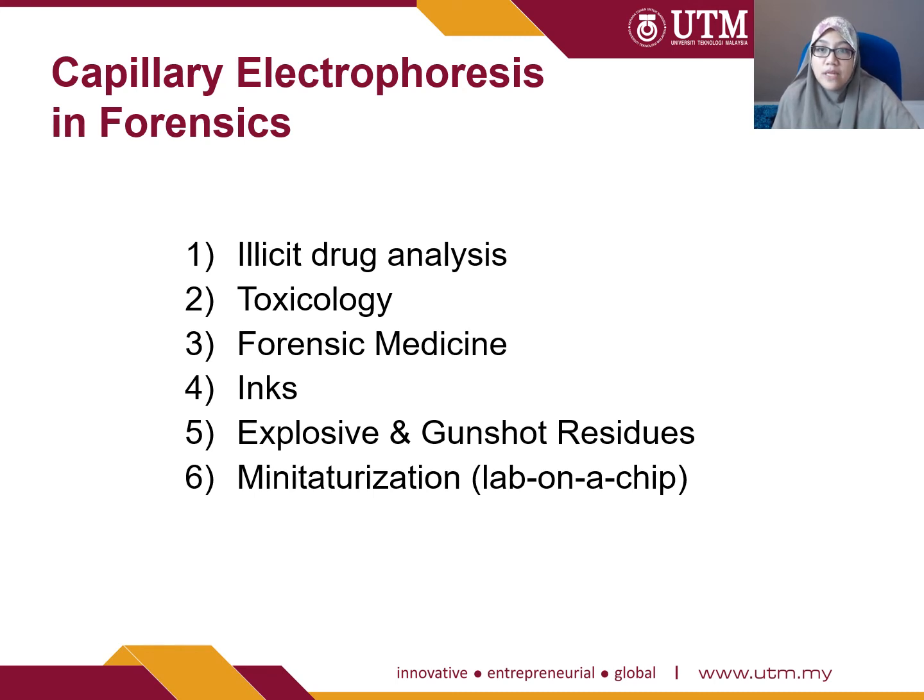And one of the analysis techniques that people have explored is capillary electrophoresis, because it can cover a wide range of organic and inorganic components.